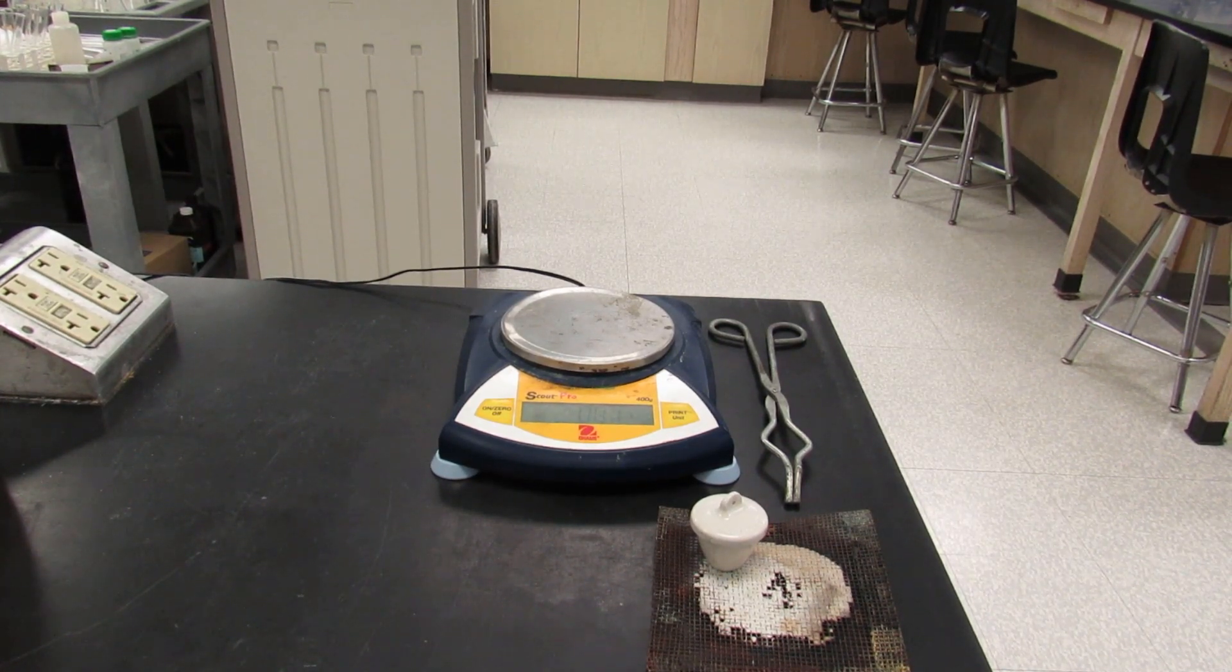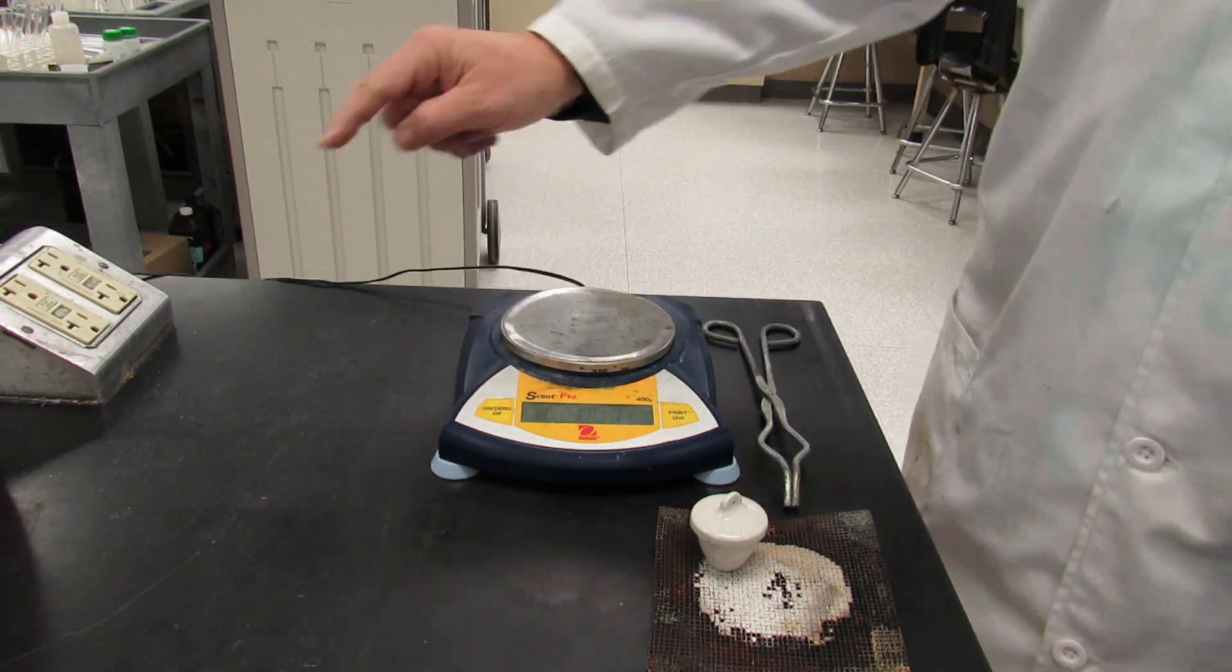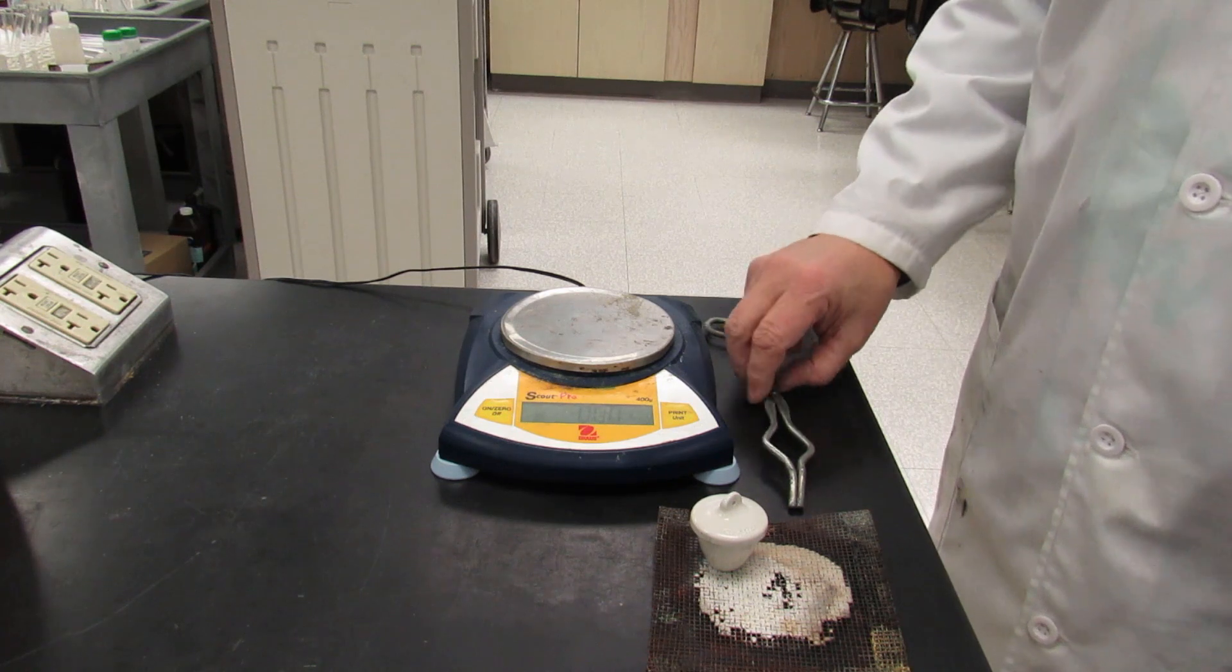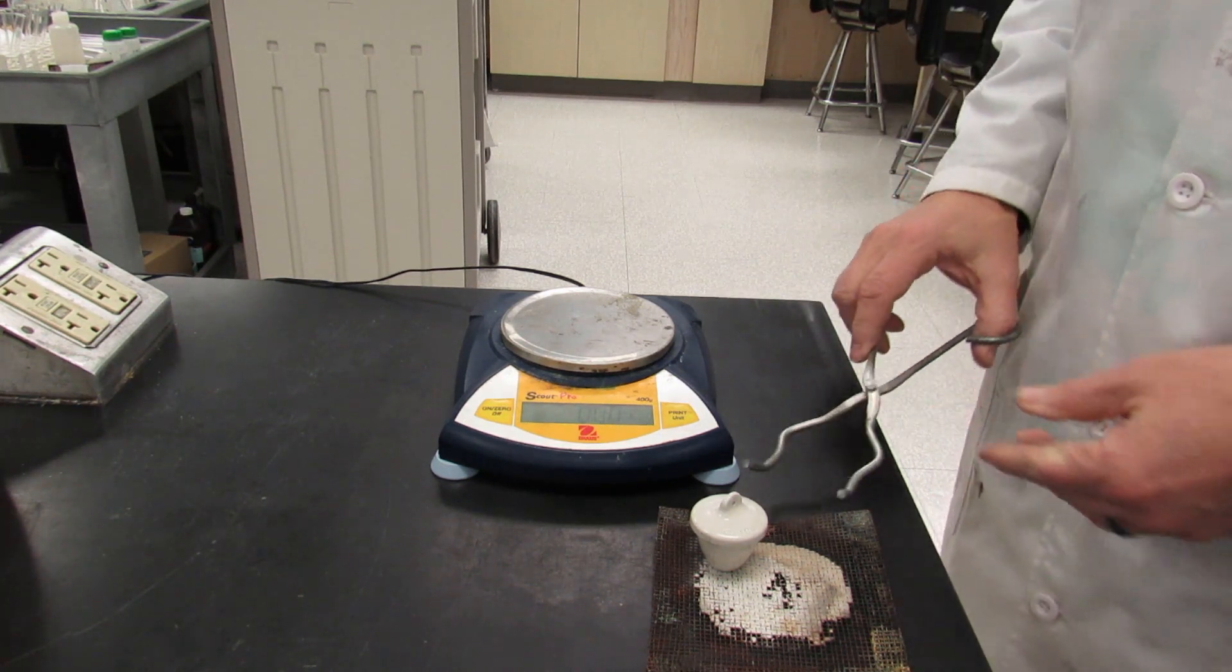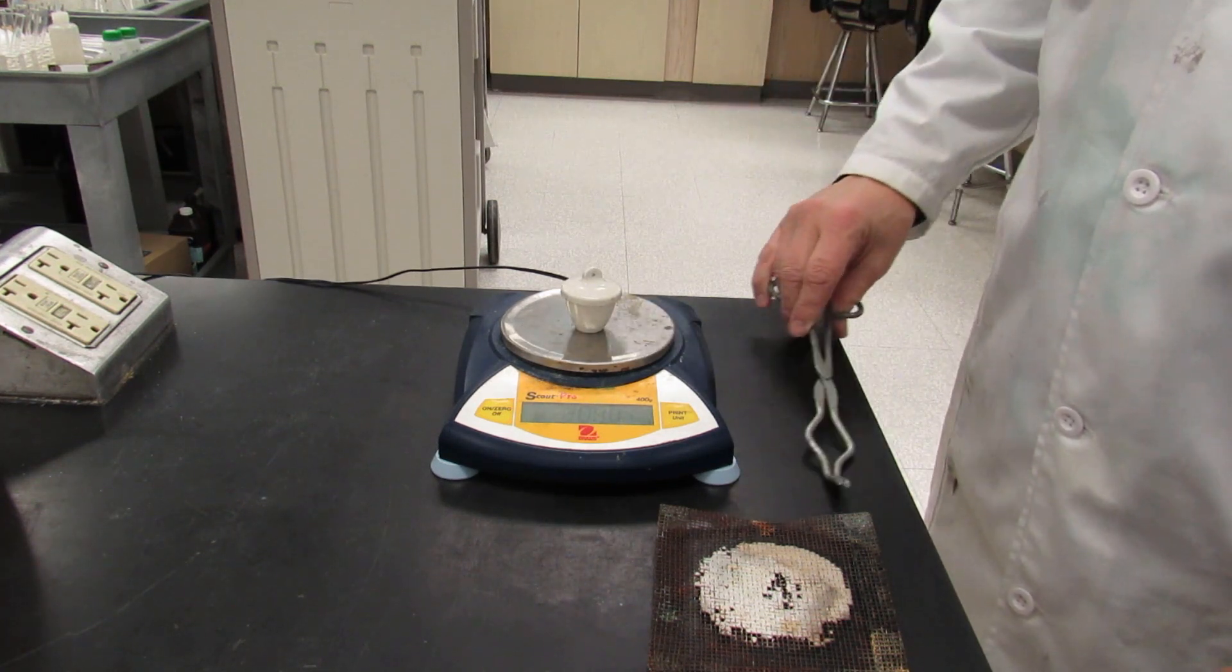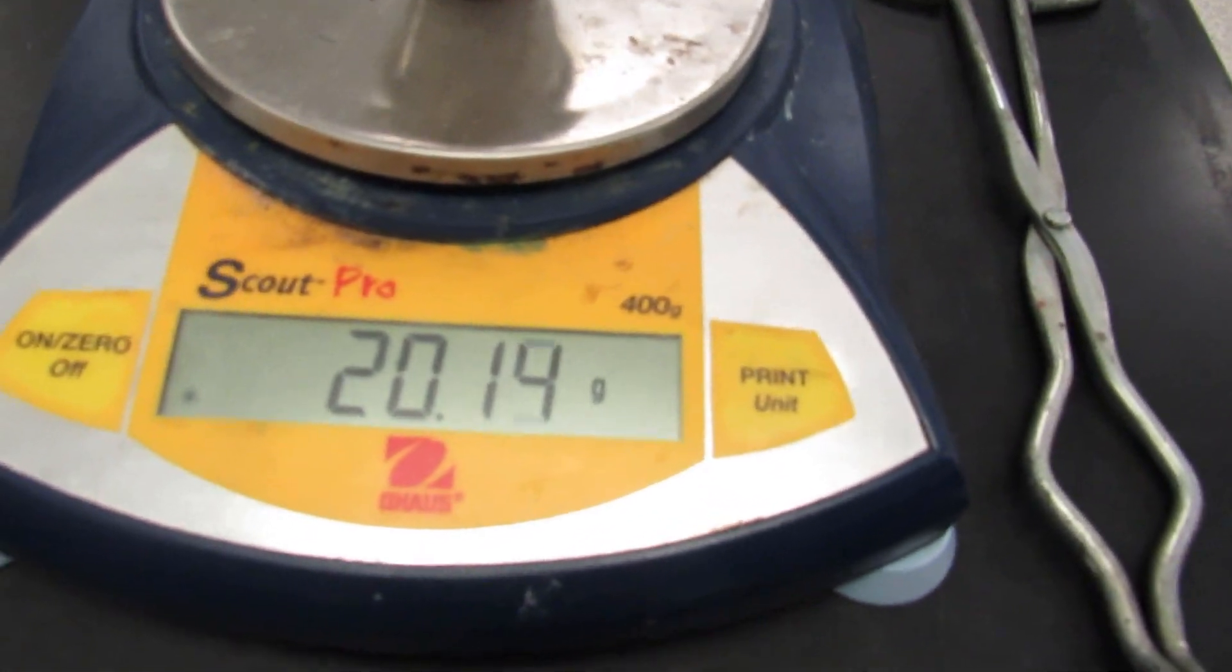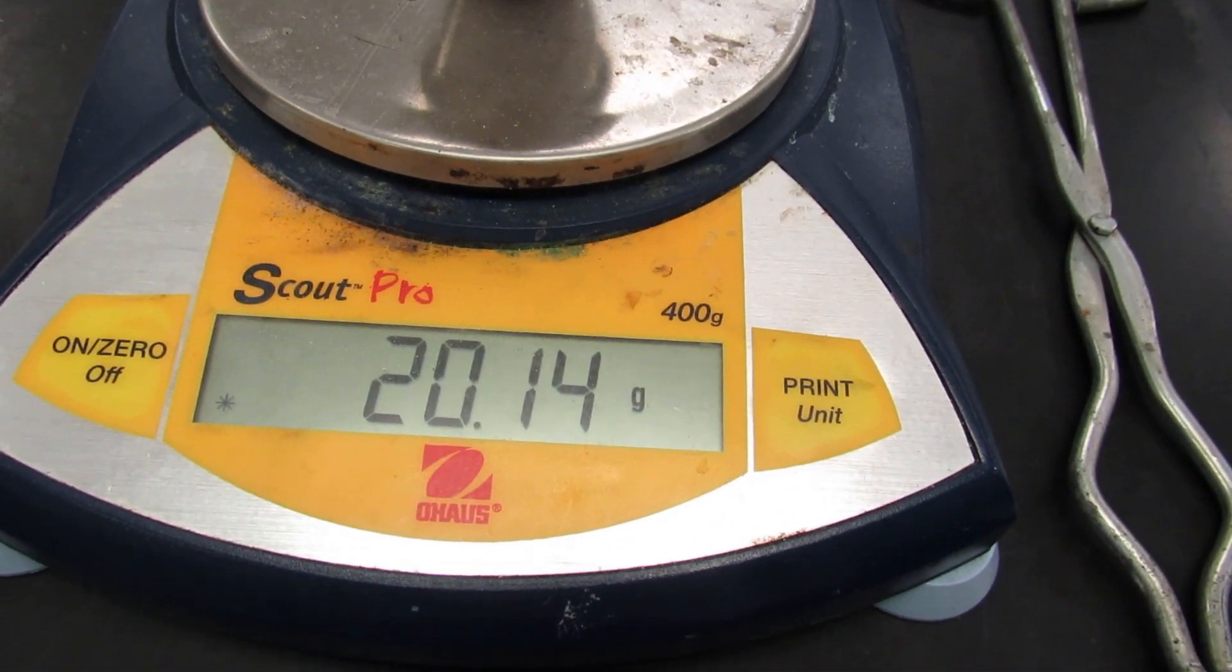After it's completely dried, you're going to go ahead and mass the crucible, the empty crucible. Zero the balance. Use your crucible tongs to lift up the crucible and place it onto the balance. The crucible and the cover has a mass of 10.14 grams.